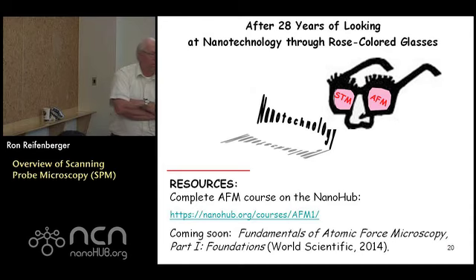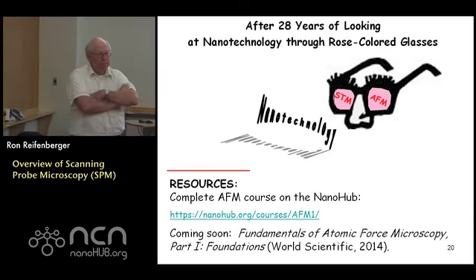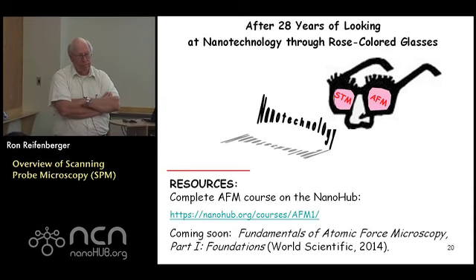If scanning probe microscopes are much cheaper than, say, the electron microscopes, and they have these capabilities, then why are there still electron microscopes? Oh, you never throw away a good tool, right?